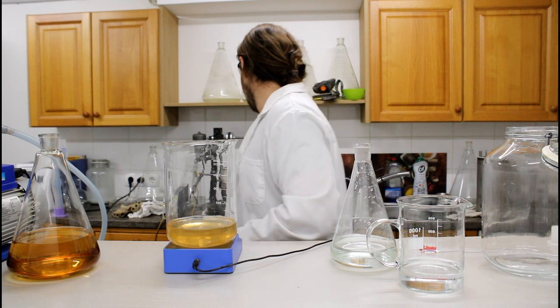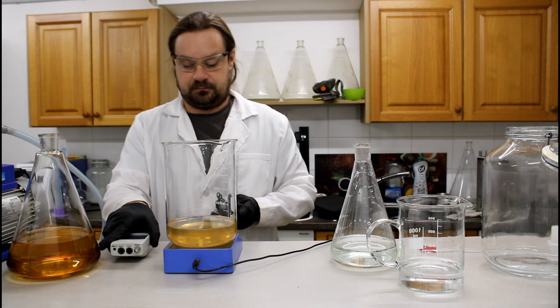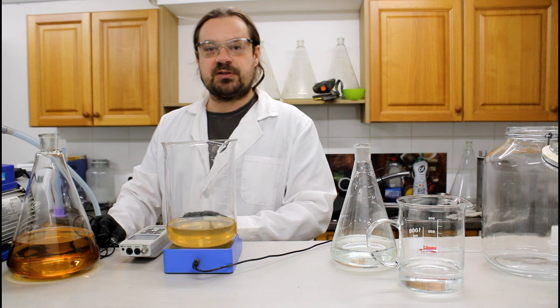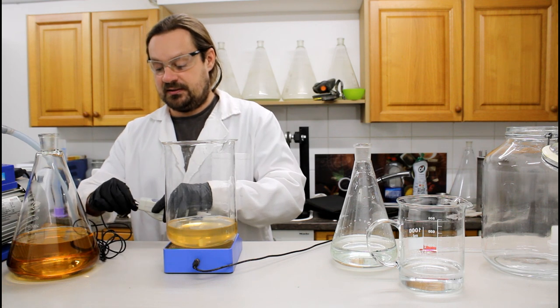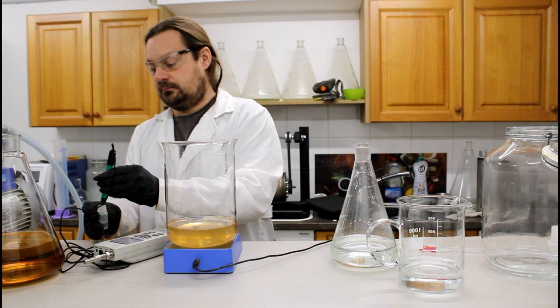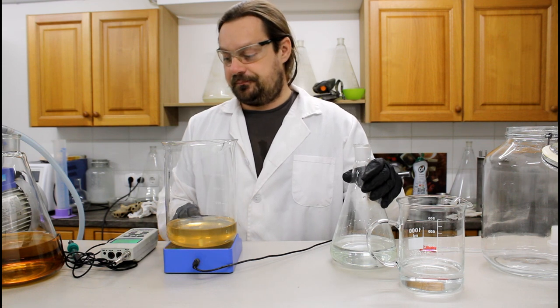And of course we need a pH meter, which is here. Insert it. We don't need the pH probe in the beginning, we just need the pH probe when the pH is already a little bit further down. Doesn't make sense to start with the pH probe inserted, but I'm going to prepare it anyhow. Okay, let's start.